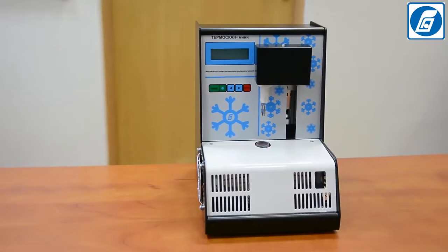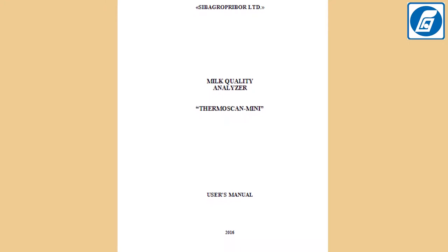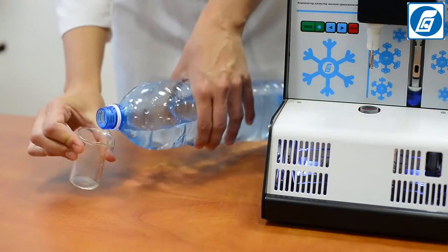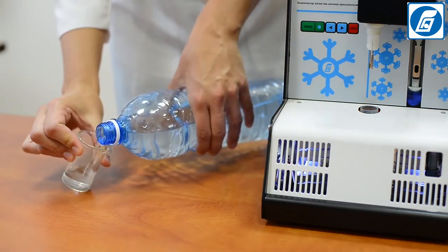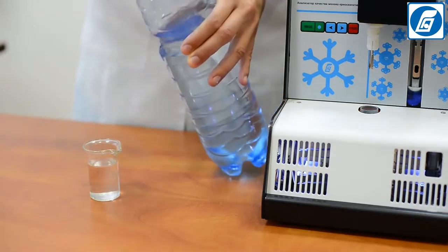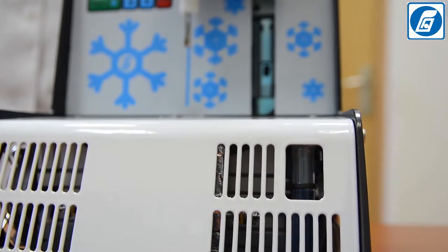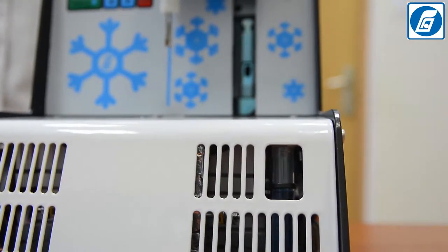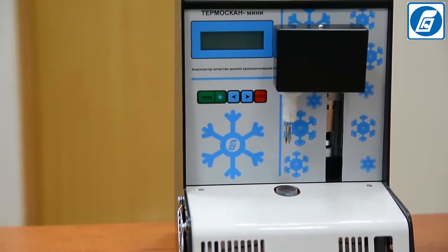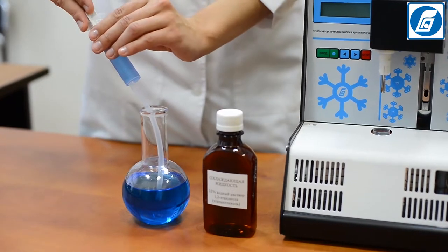Before starting work, it is necessary to read the operation manual and safety measures. We recommend carrying out testing of the analyzer after transportation using the standard solution. You can also repeat this test occasionally to check the analyzer's calibration. Fill in the cooling bath with cooling liquid — a 33% water solution of ethylene glycol — up to the given mark by means of a syringe fitted to a silicon drainage tube.